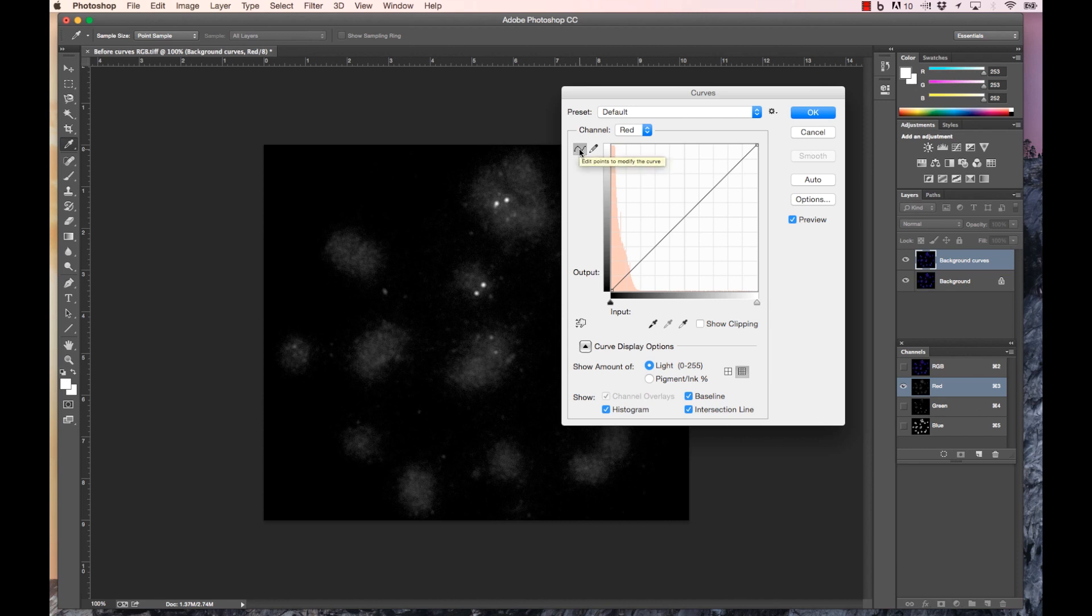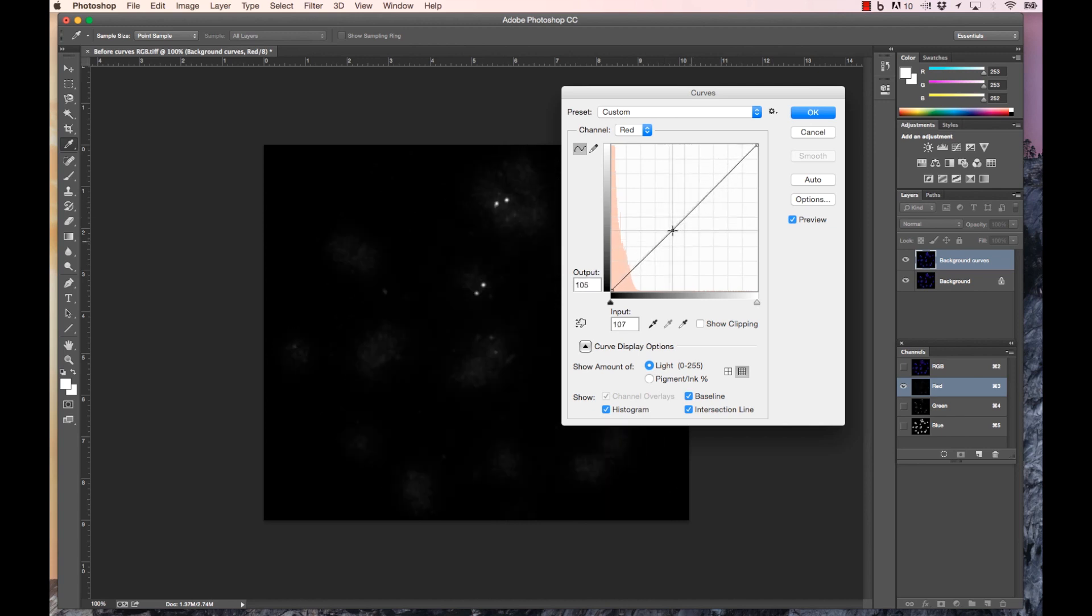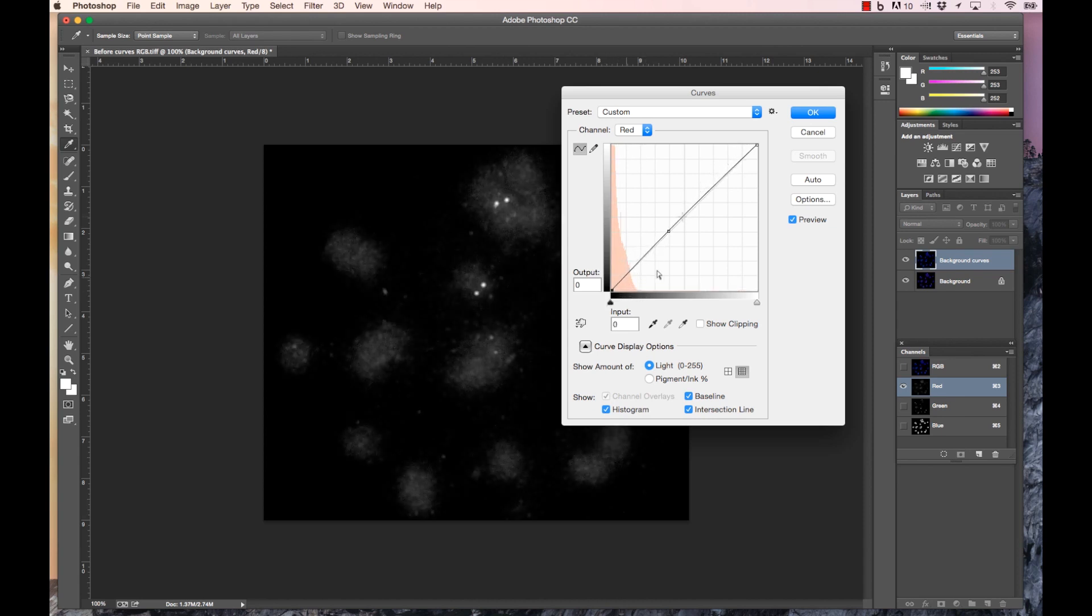Within the curves window, the anchor point option is used. The area under the histogram represents all intensities present in the image. Signal intensities can be increased by moving the straight line up or decreased by moving it down. Curves cause signal strengths to pivot around a single anchor point. For example, sliding the baseline towards the right decreases background levels but also can drastically change the intensities of all signals. The addition of anchor points is used to limit change to the region of interest.